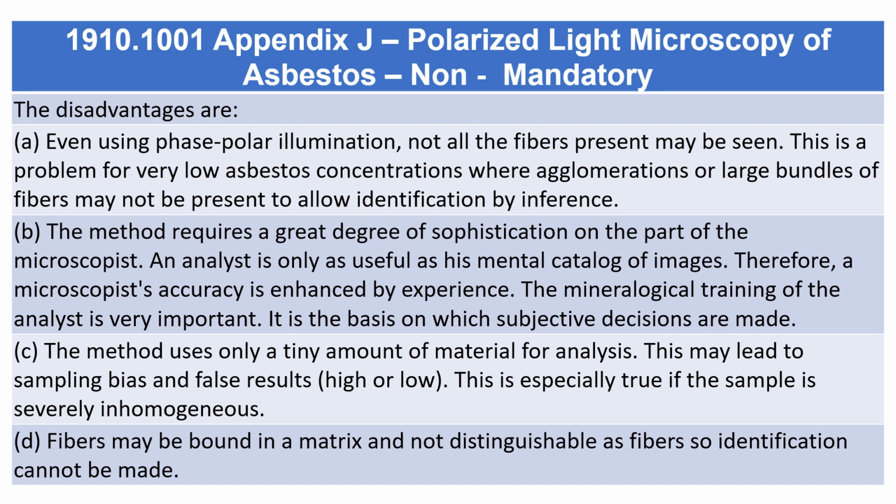An analyst is only as useful as his mental catalog of images. Therefore, a microscopist's accuracy is enhanced by experience. The mineralogical training of the analyst is very important. It is the basis on which subjective decisions are made.